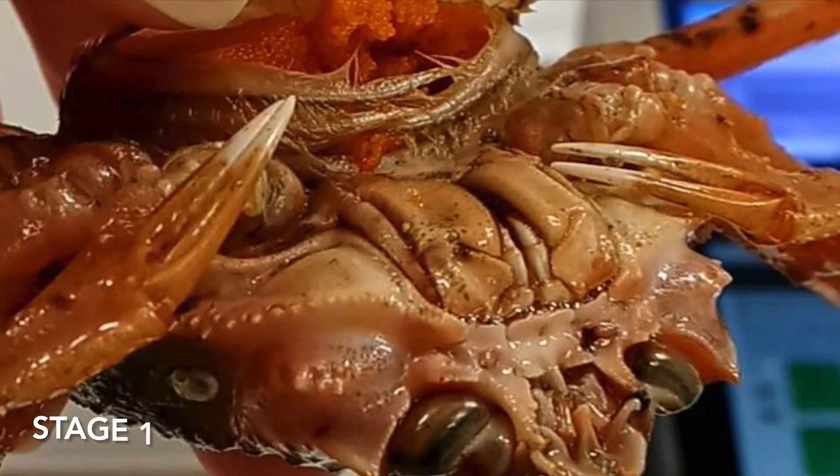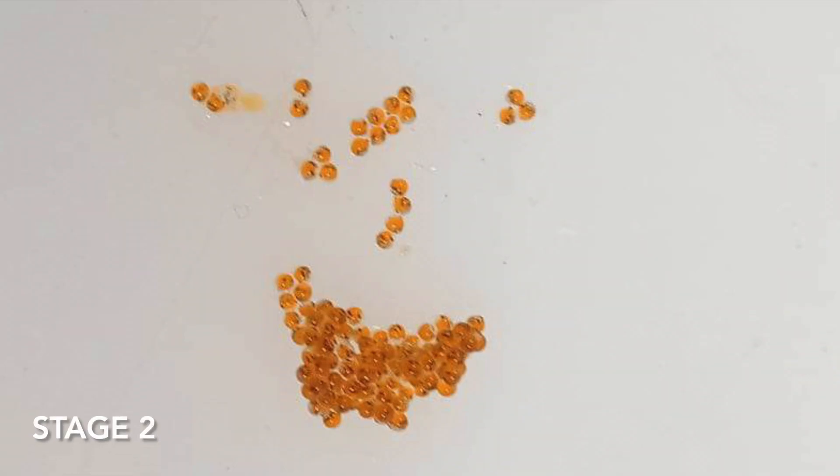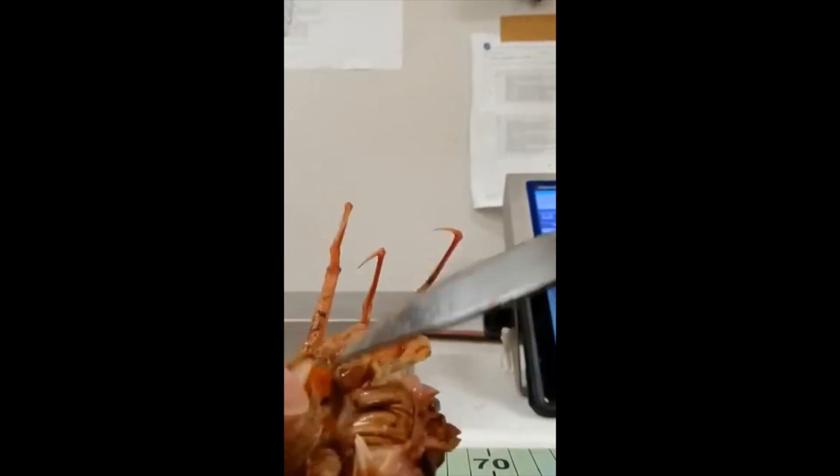In stage 1 the eggs are a uniform bright orange colour. In stage 2 the eggs are still orange, but the eyes are becoming visible as black dots as shown here. To distinguish stages 1 and 2 it helps to gently remove some eggs and view them against a white background.